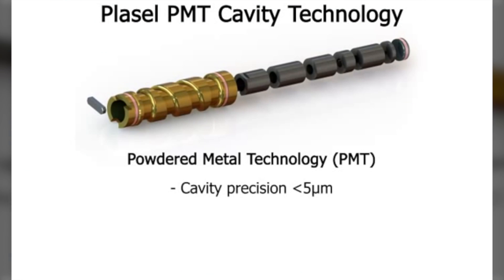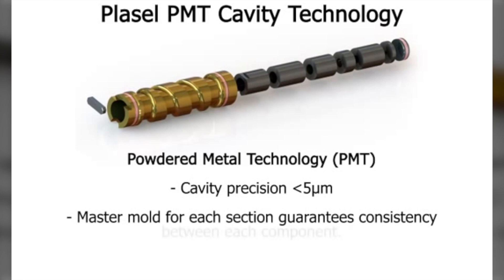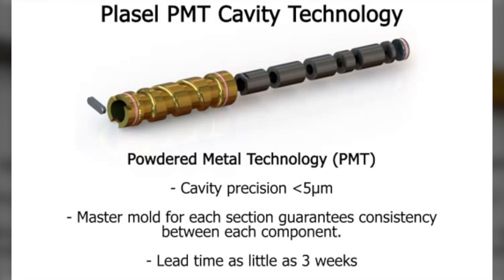The PolyShot Pipette Tip Mold features cavity sections with technology developed by Plasel Mold of Lavon, Israel. This technology, referred to as PMT — Powdered Metal Technology — allows cavity section production with cavity-to-cavity accuracy of less than 5 microns. The use of a master mold for each cavity or cavity section guarantees each component to be precisely the same, including all future spare cavity components. The technology allows the cavity sections to be produced as an integrated one-piece unit or with individual sections stacked as wafers. Spares can be ordered with a mold or delivered in as little as three weeks at any point after the initial order.